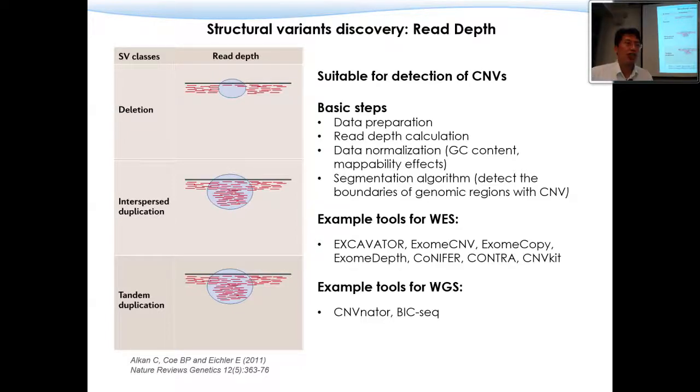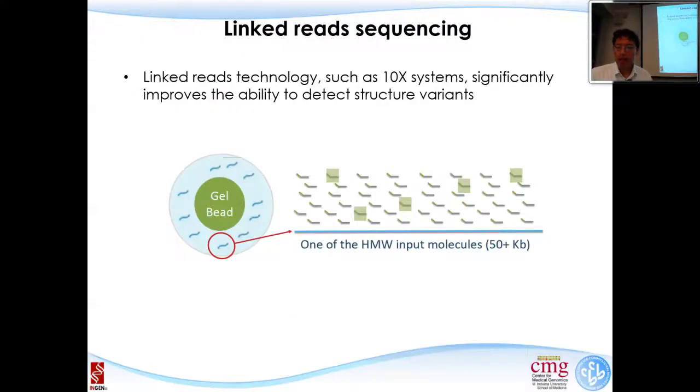Other questions? Okay. So for structure variation, there is another level of signal, or approach, that we can use to tackle this a little better. This is the third straight lecture where I brought up 10x linked read sequencing, just to refresh your memory a little bit.